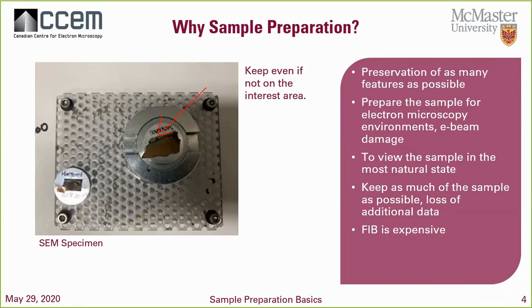We want to see the sample at its most natural state, right? Zero contaminants, impurity free. That's what we prepare, right? We want to keep as much of it as possible, right? I don't want to throw this out, right? I want to make sure that the customer has had all of the questions answered before I can get rid of it. In terms of FIB, right? Sometimes it's a good understanding that FIB is really expensive and a lot of customers will want to look for an easier way out.